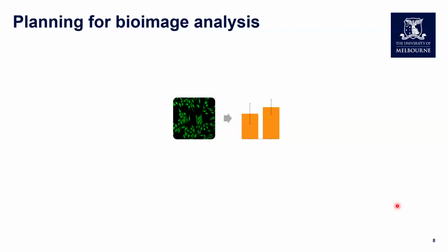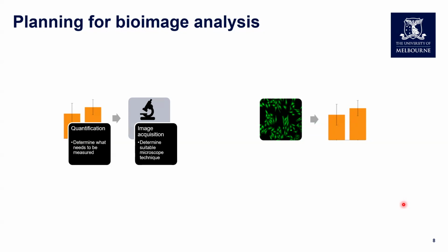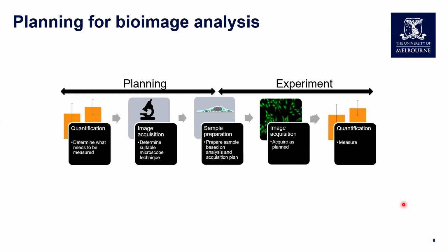In fact, if you're planning to analyze your microscope images, this analysis part will be the last step of the entire workflow. The first step is to plan your quantifications. That's to determine what needs to be measured, of course. And then we can determine the suitable microscope techniques and then prepare the sample based on those plans. So the planning should take place properly before any measurement begins.